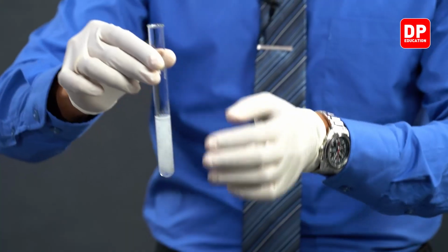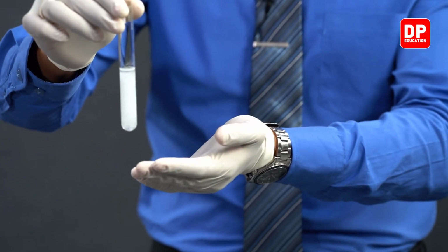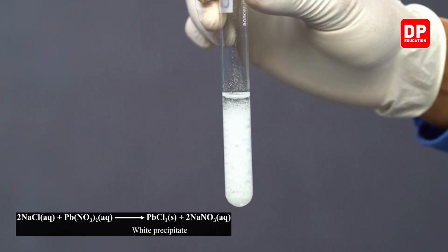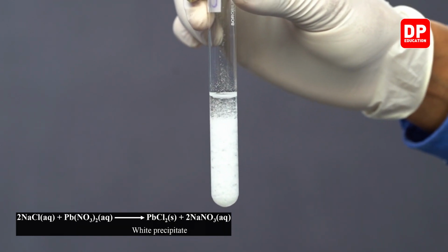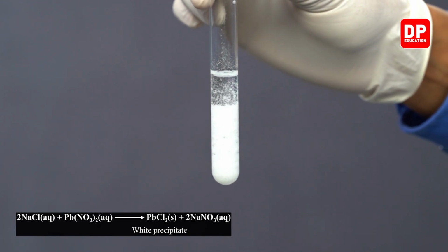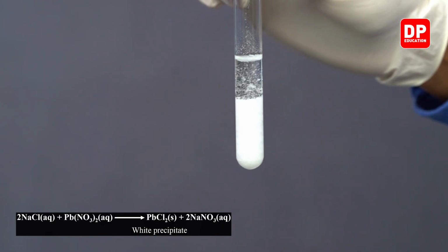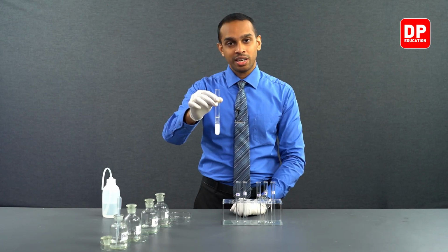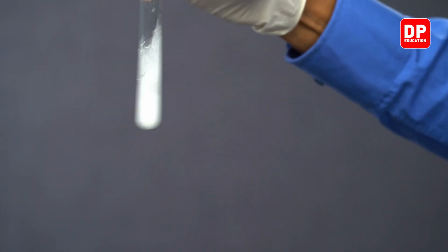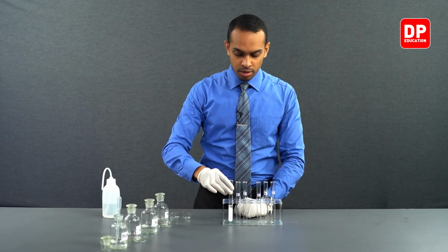Now please observe, students, upon addition of lead nitrate, we are seeing a precipitate being formed slowly. This precipitate is lead chloride, a water insoluble white color solid. PbCl2 is the formula. You can see a nice white color precipitate forming and already accumulating at the bottom. We'll give it a little swirl and then leave it aside and move on to bromide ions.